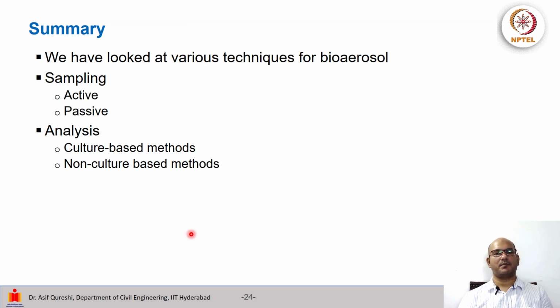So in summary, we have looked at various techniques for bioaerosol characterization. This has ranged from sampling, which was active sampling and also passive sampling, and then also analysis using culture based methods and also non-culture based methods.